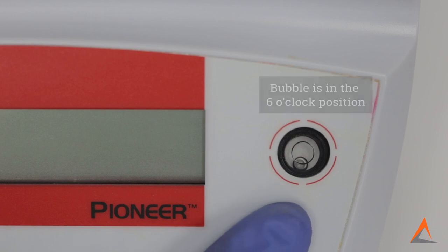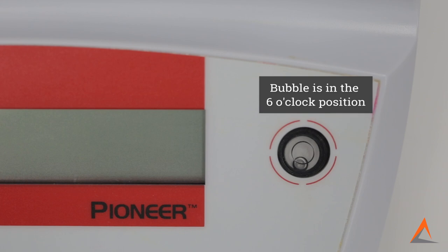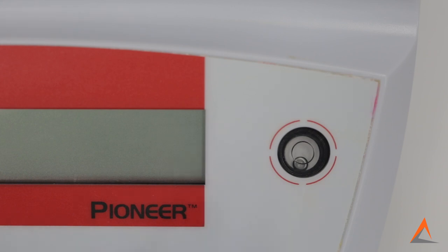For example, if the air bubble is in the six o'clock position, this means that the front of the balance is higher than the back. Therefore, it is not level vertically. It is, however, level horizontally as the bubble is not towards the one o'clock or eleven o'clock positions.